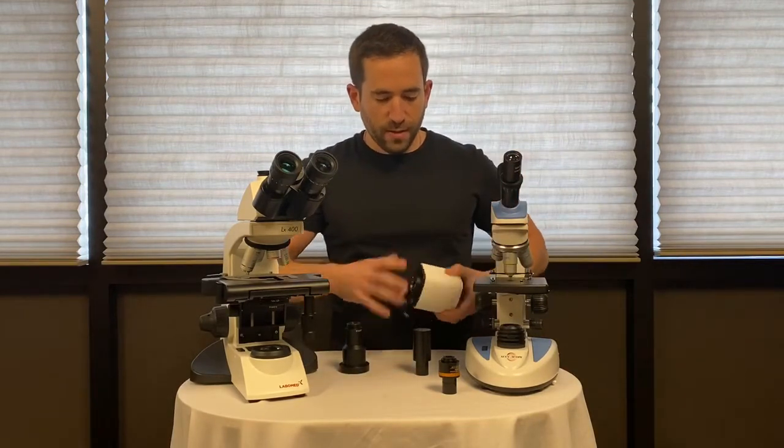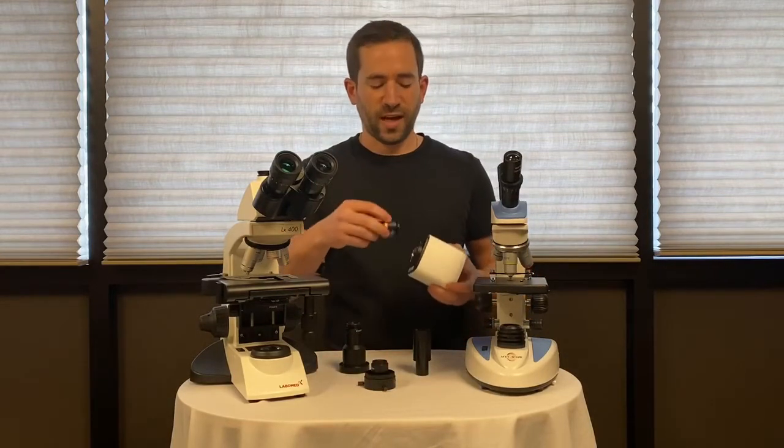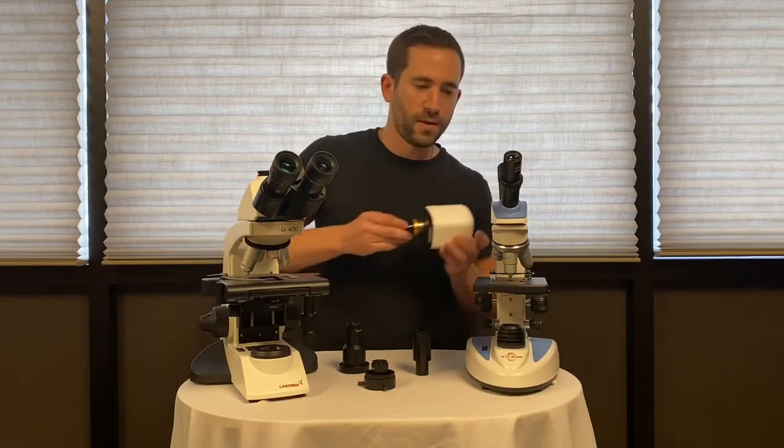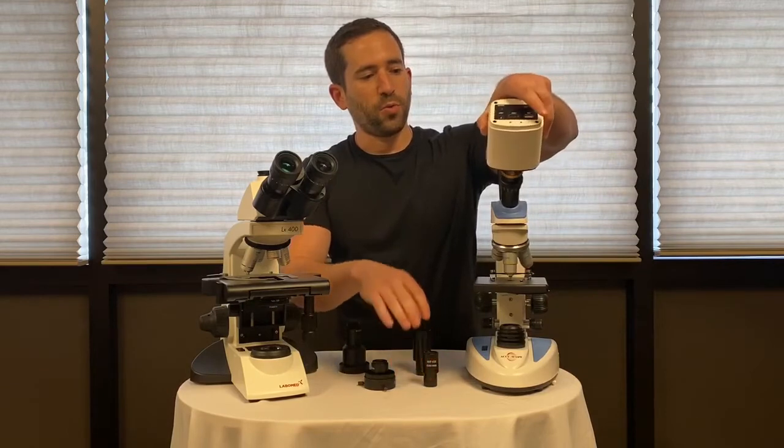The preferred method would be with a drop-in photo tube, which has a C-mount at the top. Thread it onto the camera, remove your eyepiece, and drop in the camera with the tube.